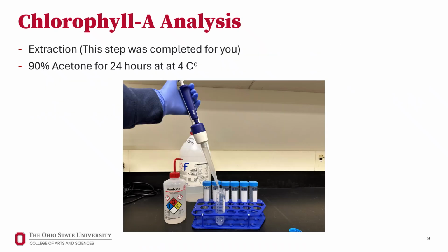There are many different techniques to extracting and analyzing periphyton and phytoplankton samples for chlorophyll-a. I will only be describing the technique that we are going to be using in this class. But if you go on to work in a lab, they may use a different technique. You'll remember that we put the GFF filters in the freezer after we finished filtering them in the last lab period. The freezing and thawing of these filters helps to burst open the cells, which releases the contents, including pigments, from inside the cells.